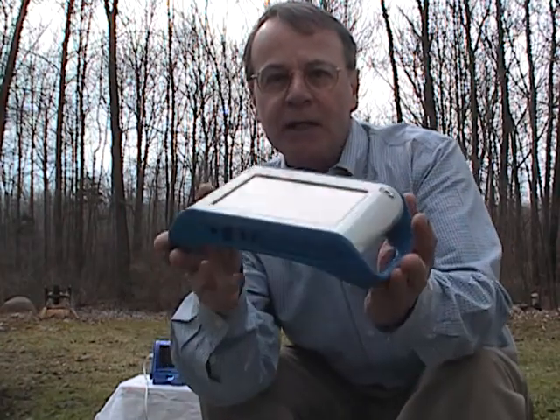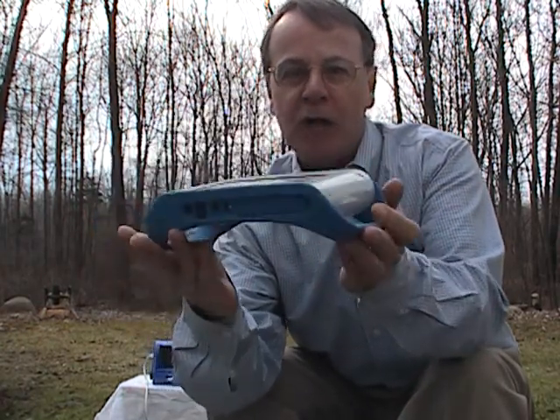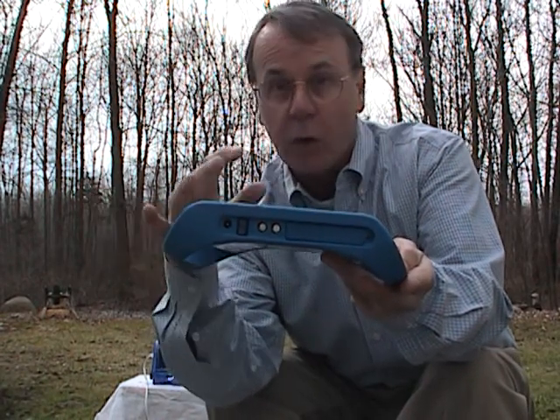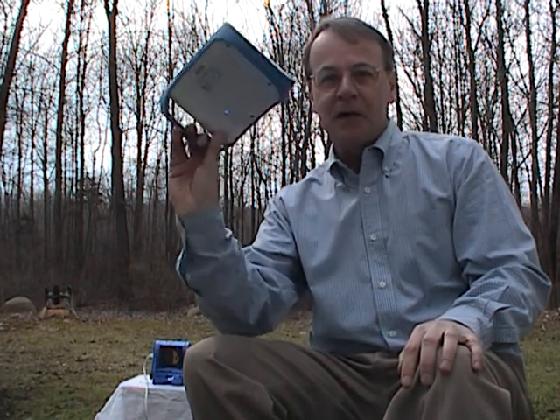Ken Royal here for the Royal Treatment at Scholastic. Today my review is of the Pasco Spark. It's a great little science lab unit that you can use on a science lab table in the classroom, hooked to a computer or not, or bring it outside in the field and do some real science work outside untethered.